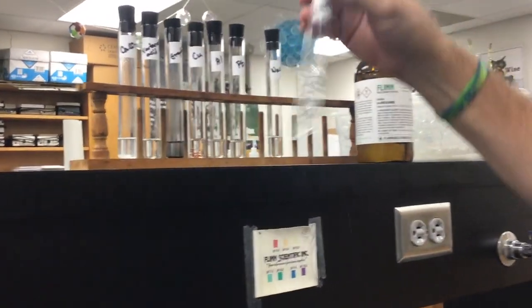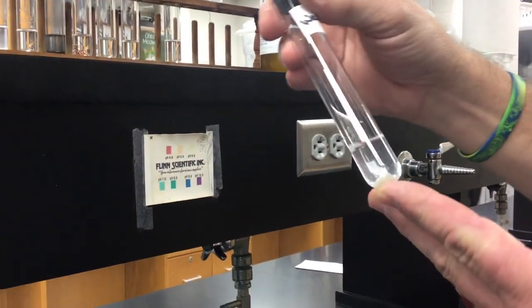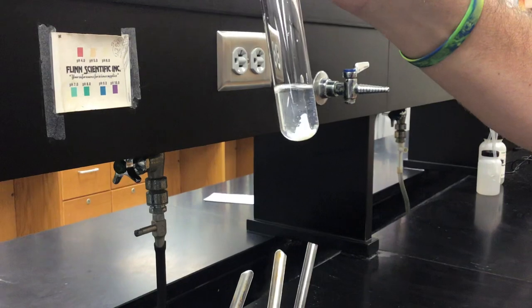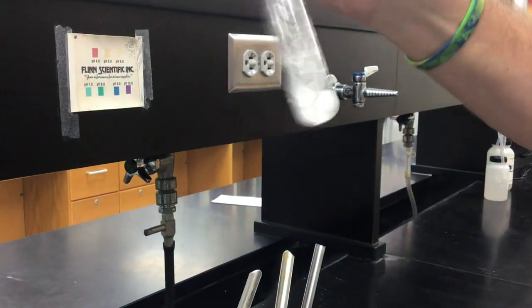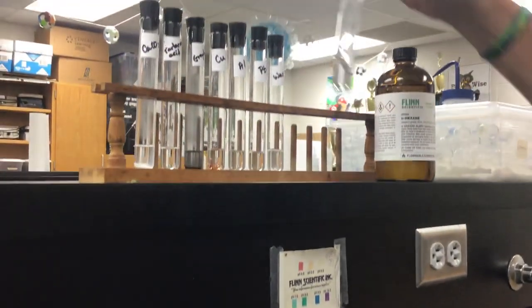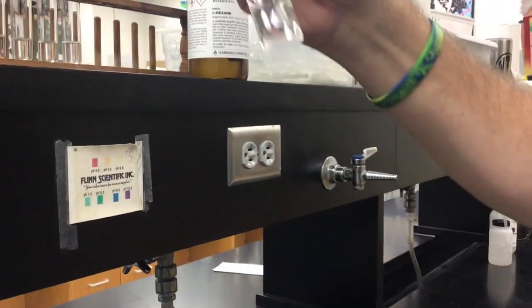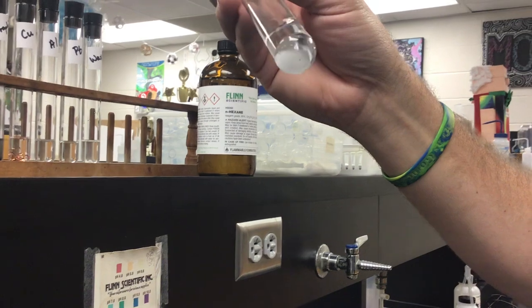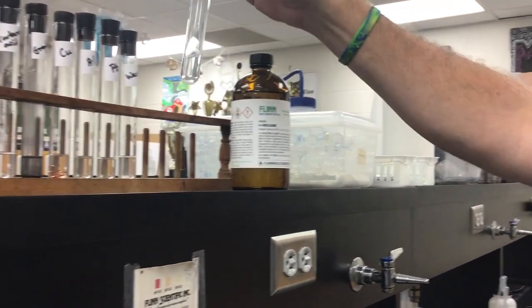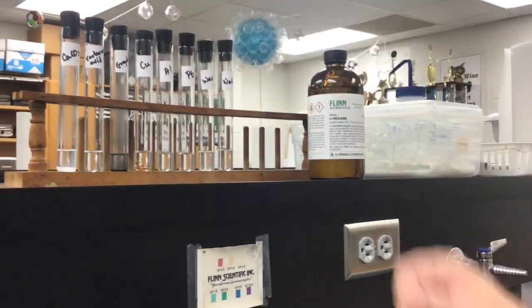And then the wax, looks like there might actually be less wax in there than there was before. Well, there's your wax. Most of the small particles are gone, it's just that big particle that's sitting there. There's your wax. And then your NaCl, I still see quite a bit of salt sitting there on the bottom. So that's for the solubility of those two.